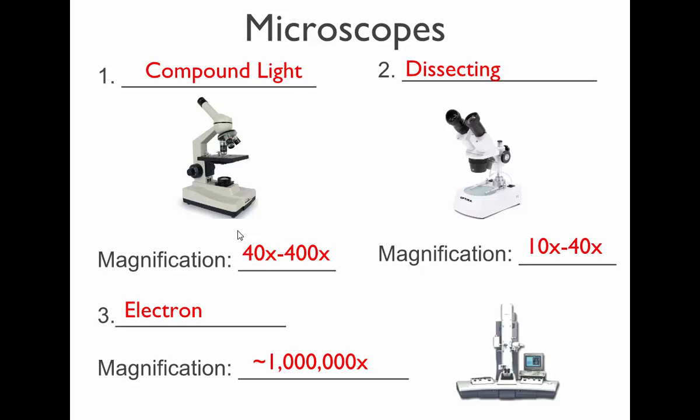I took this image using the electron microscope. This is of an owl feather. Like these are the individual little fibers that make up the feather of an owl. It's really, really neat to see. But they have a special room dedicated to it. It looks more like a computer than it does a microscope. It's not something you put on a desk. It's a whole big unit that's as big as this front desk maybe.